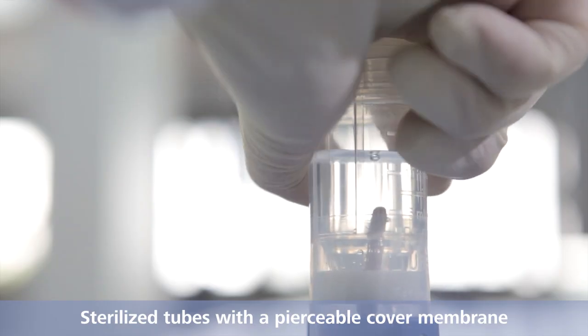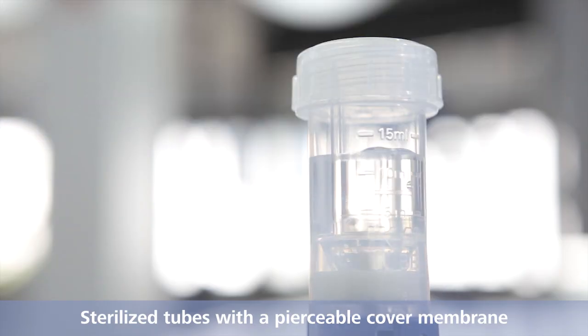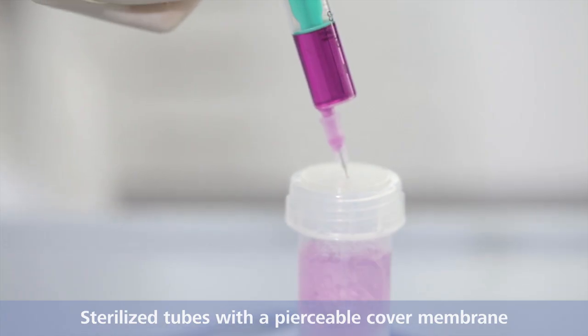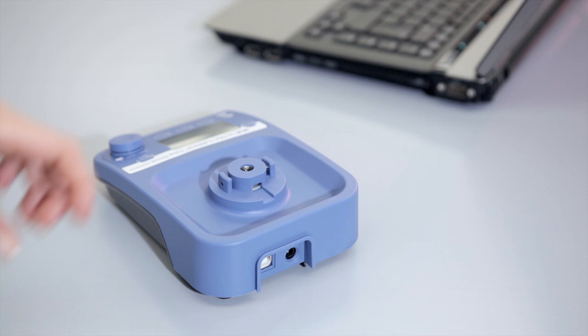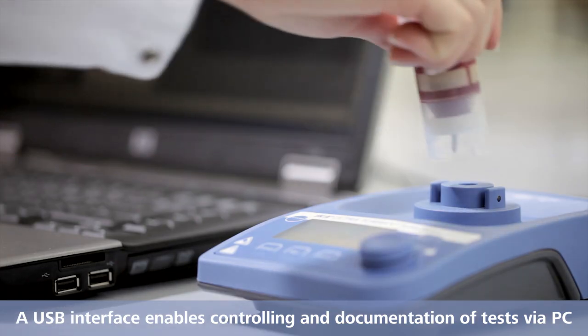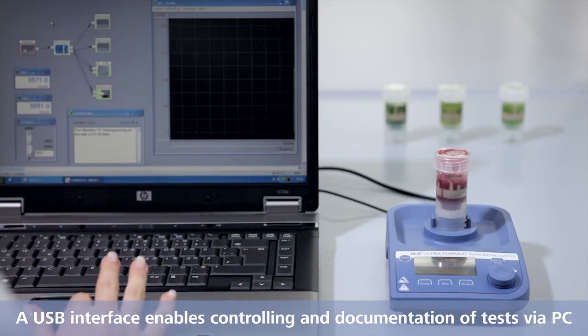All tubes are also available with a pierceable cover membrane and gamma sterilized. A USB interface enables controlling and documentation of tests via PC.